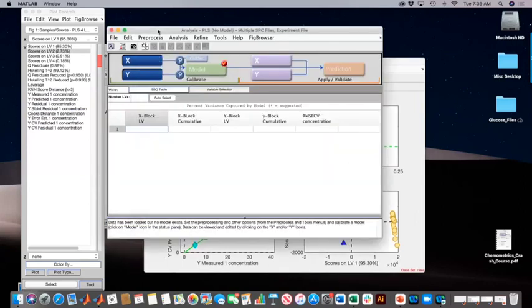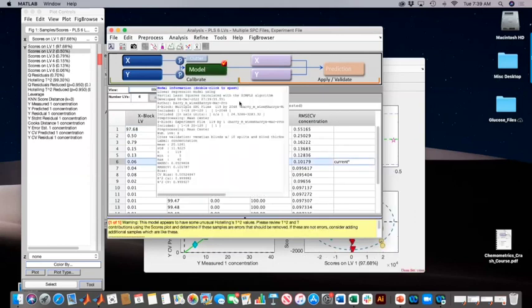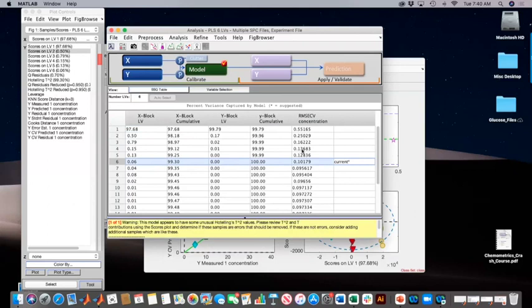And now, of course, I have to make my model again without it. And you see that a lot of our error over here was due to that. We were around 0.4 in error, and now we're all of a sudden down in the 0.1 something. So a lot of our prediction error was really associated with just that one sample.